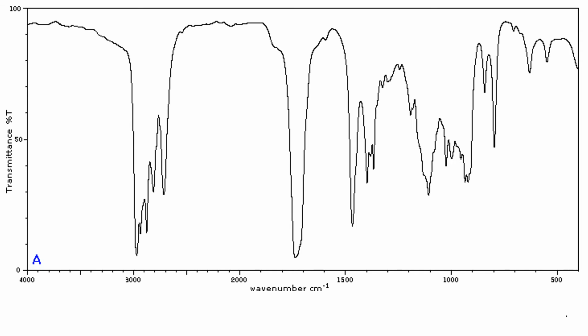Hello chemists, today we're going to be talking about our second type of spectrographic data analysis, and that is infrared spectroscopy. This is different from mass spectroscopy because it is looking at the presence or absence of bonds, as opposed to mass spectroscopy, which was looking for the mass of certain fragments of a molecule and the mass of the whole thing. The way that infrared spectroscopy works is you shine an infrared light through a sample that has been turned into a gas, so you heat it up and you shine a light through it.